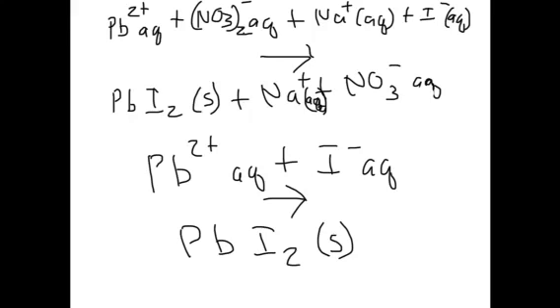Some had PbNO3 react and some had sodium iodide react, and I think this is just human error. We can't be perfect in a school lab. Even really good scientists who have expert equipment find it really hard to be perfect, and that was just human error that explains the inconsistencies.